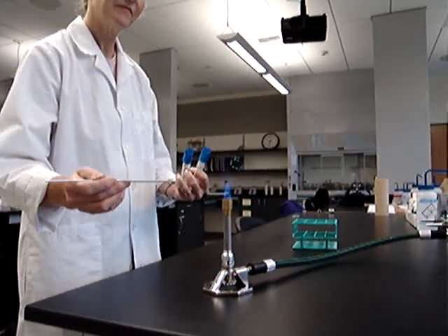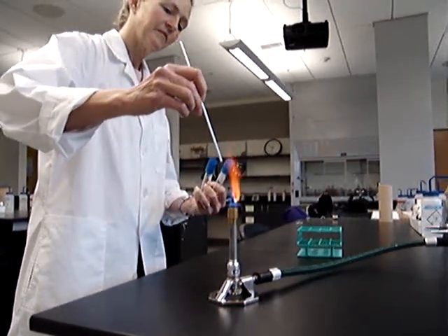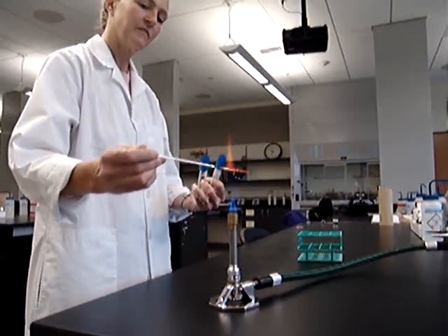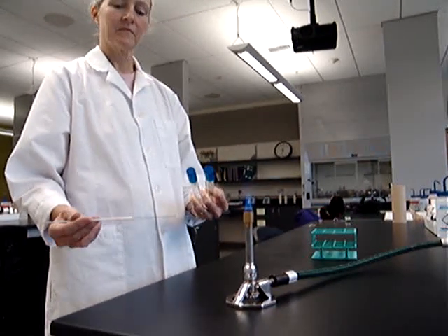She's going to sterilize the loop. First, she places it in straight away, and the reason she does that is she doesn't want to create an aerosol. Now she's disinfected the loop, making sure it's bright red-orange. She'll let it cool for approximately 30 seconds.